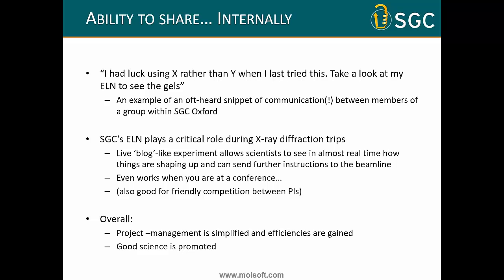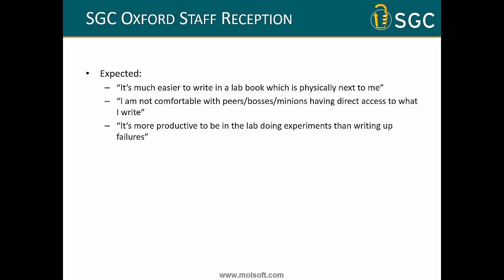And overall, project management is simplified and it's much more efficient, and what we hope is that good science is promoted. And I think one of the good aspects of the SGC over the years is that we've developed a really good reputation of being able to produce reproducible data and reproducible protocols, and this has been a key aspect of that. So this is what the Oxford staff reception was like back in 2004.